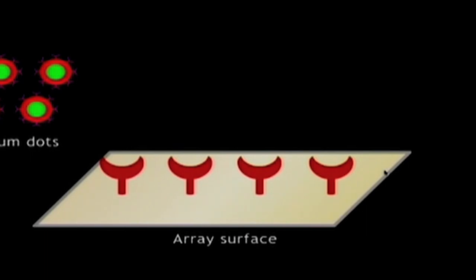They are made up of semiconductor devices which form excitons upon absorption of light. There is emission of a narrow energy band when these excitons return to their lower energy level. Let us click on these quantum dots to view how they work.